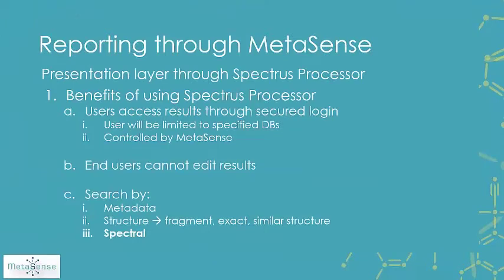One of the benefits is that the users will be able to access this information anytime they need to, but they will be limited to specified databases. So again, the MetID expert will have full control of what information is being accessed and by who. Again, this is controlled by MetaSense. The end users cannot edit any of the results. So again, it's purely to view the results from the data processing.